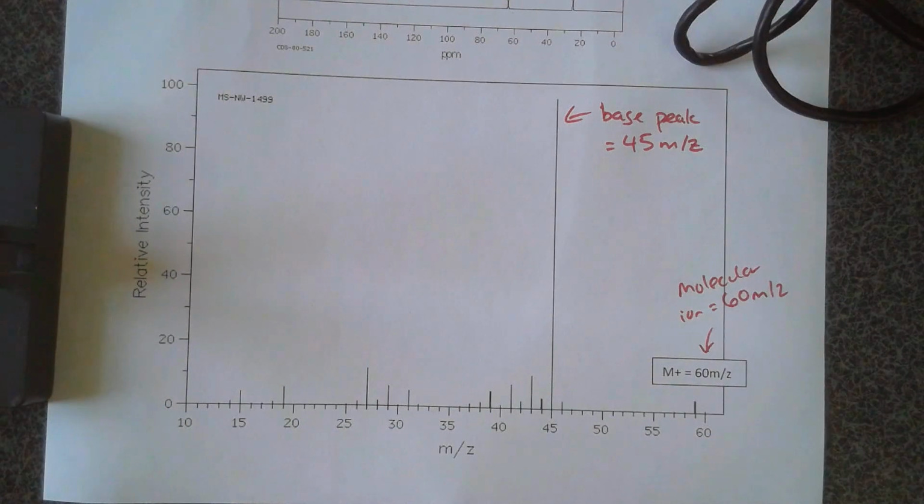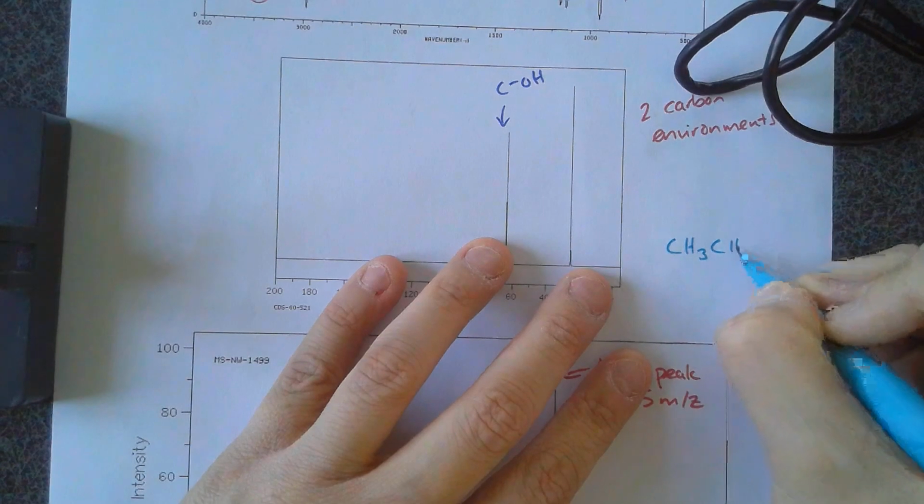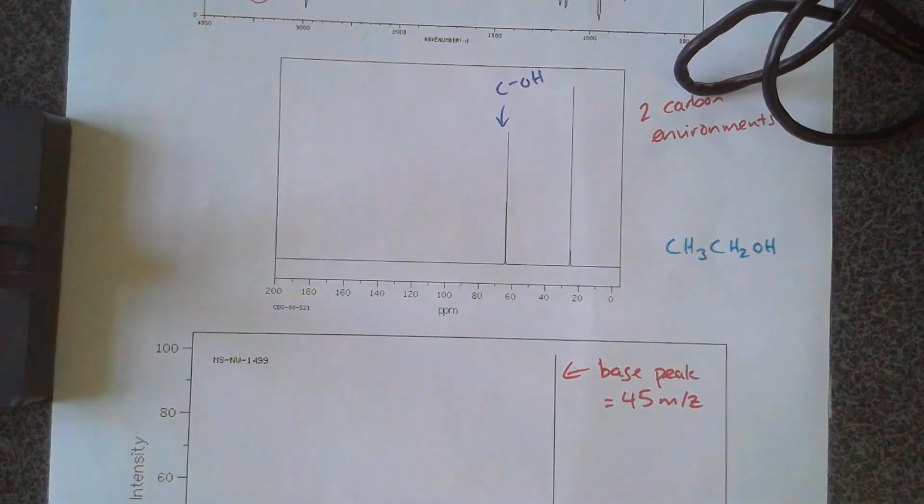Are we okay with that so far? All right. Let's start taking some guesses of what molecule I have here. So I have 2 bits of information. I know I have an alcohol, and I know I have 2 carbon environments. So if I'm assuming the bare bones stuff, I would say, oh, I must have at least ethanol, because that fits the components of it.